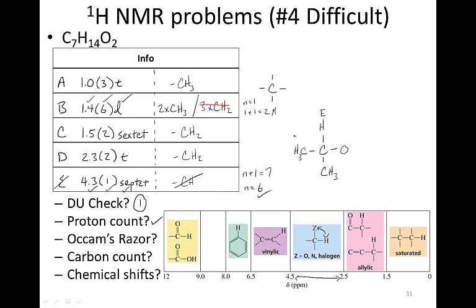So it seems pretty likely at this point that these two CH3 groups are going to be protons B. Okay, so it seems that we've explained these two CH3s, so we'll go ahead and strike all of these out. And we're also going to go up above and acknowledge the fact that we've deleted one of the oxygens that we have to explain, and we have to also acknowledge that there's still one more oxygen that we still need to explain away. Okay, so that's one extra oxygen.